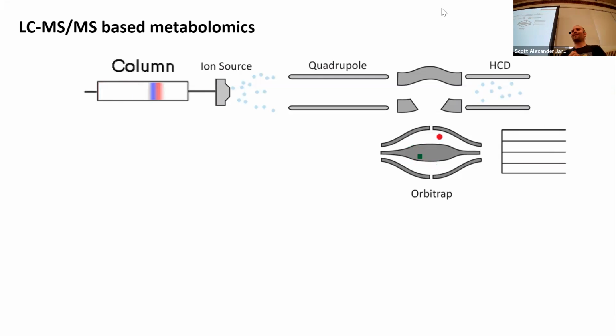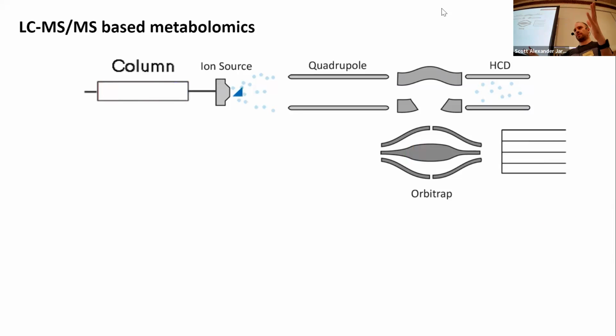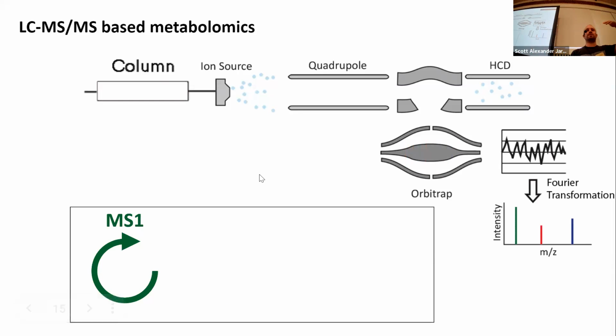We want to briefly recap what's going on right now in this data analysis. We talked on Monday about the general data structure. We have the chromatography as one dimension. Then we isolate ions, fragment them, and generate MS2 spectra as fingerprints for the molecules. We also have the MS1 events next to it, in this data-dependent duty cycle, so we have a combination of MS2 data and MS1 data.